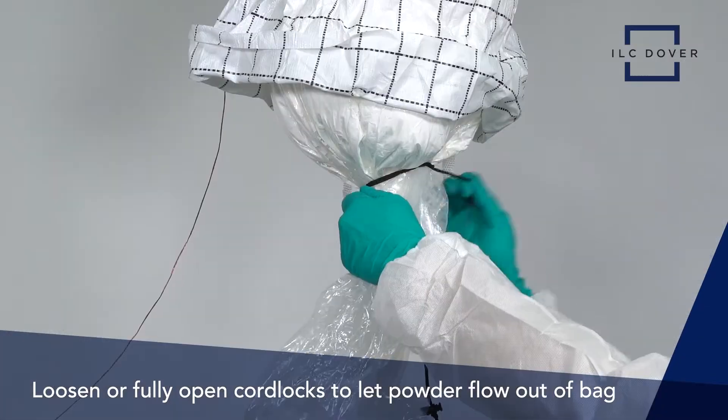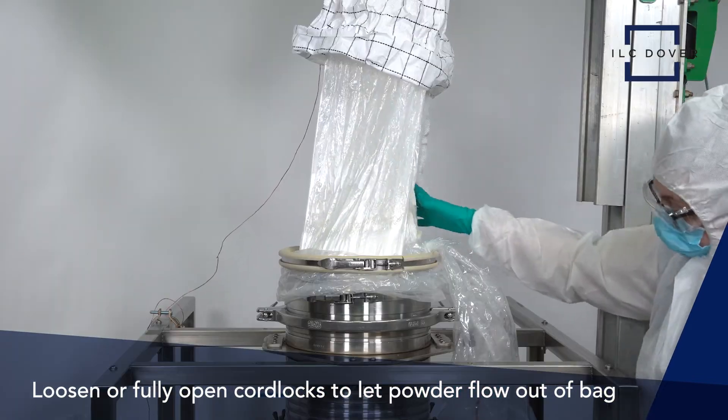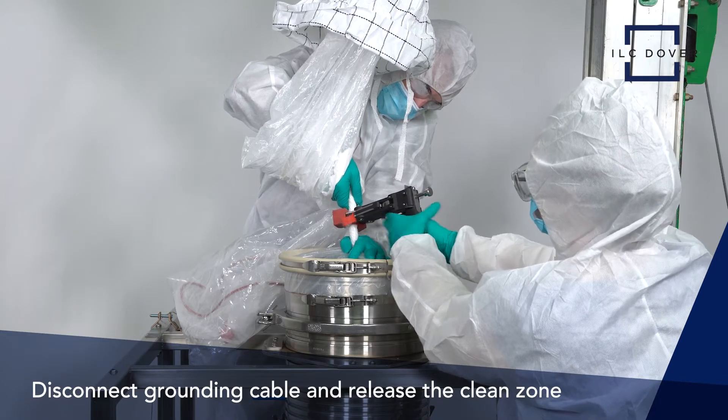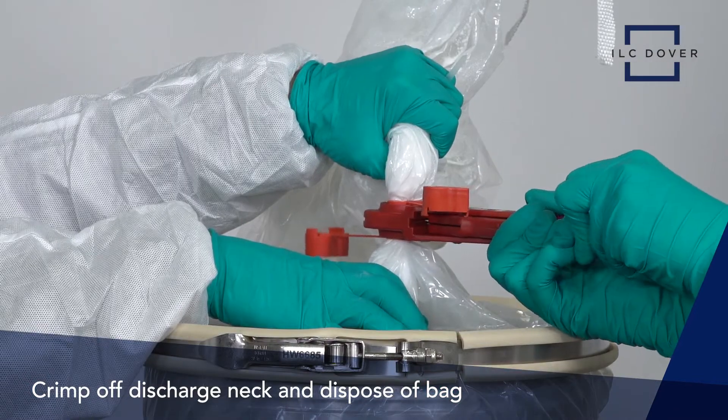Loosen or fully open the cord locks to let the powder flow out of the bag. When finished, disconnect the grounding cable, release the clean zone, and crimp off the discharge neck and dispose of the bag.